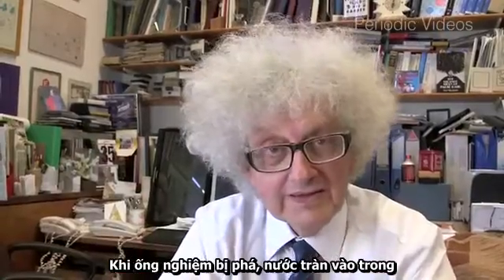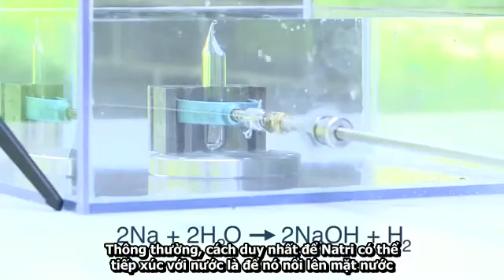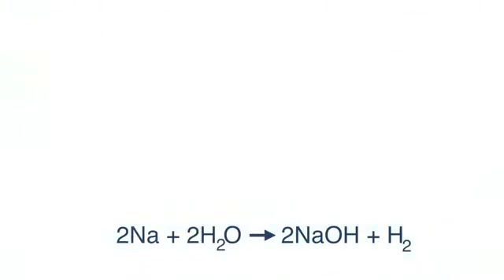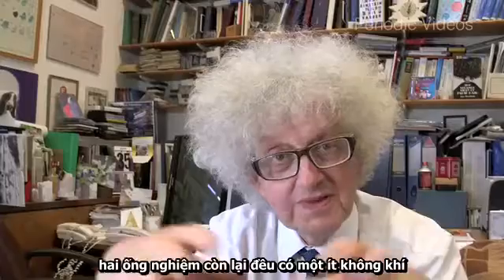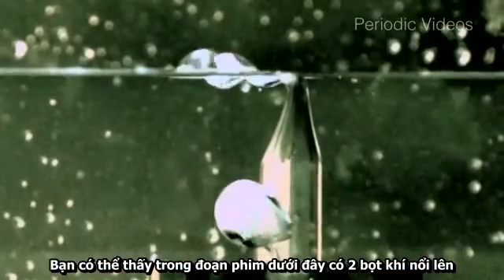When the tube breaks, water rushes in and the reaction starts. The only way the metal can come into contact with air is if it floats up to the surface. In our caesium tube it was evacuated without any air, though in some of the other tubes there was air. In one video the tube wasn't quite properly sealed so it was full of air.